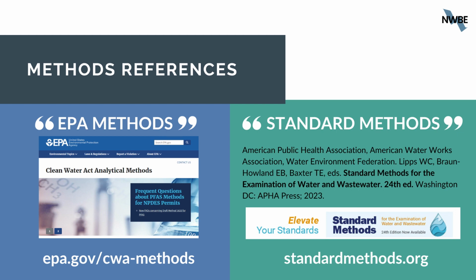But you can find the EPA approved methods at epa.gov/CWA methods, and you can find standard methods at standardmethods.org. It does require a subscription to access all of the methods on standard methods, but you can read the introductions to each method for each analyte without a subscription.